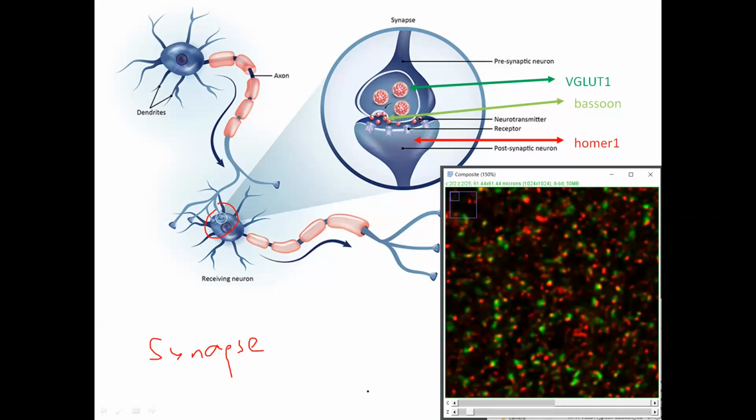So to do that, what I did was an immunostaining. But of course it would also work if you have some labeling through GFP, tomato, or whatever fluorescent protein you express. The main point is that we have spots, objects in the image that look like spots.